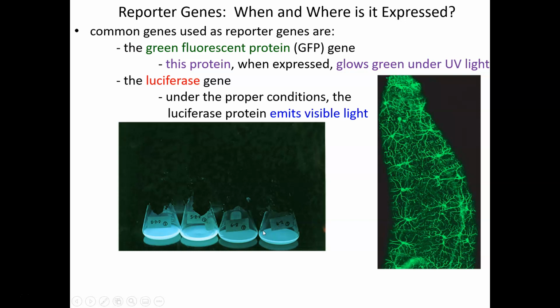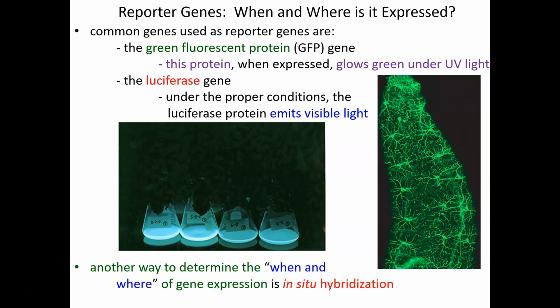So here, if we see light is being made, that means the luciferase enzyme is around. If the luciferase enzyme is being expressed, that means the promoter is active, and we've just understood what's triggering our promoter. The promoter of our gene of interest is the thermostat in the wall, and the luciferase here is the light bulb we've rewired it to so that we can easily measure and detect when our promoter is active.